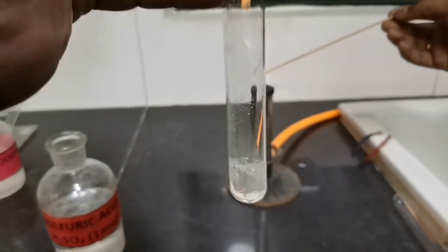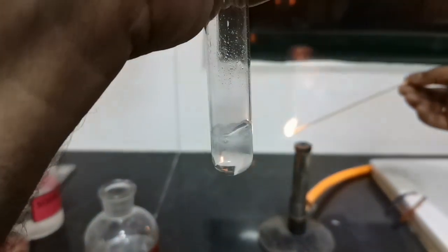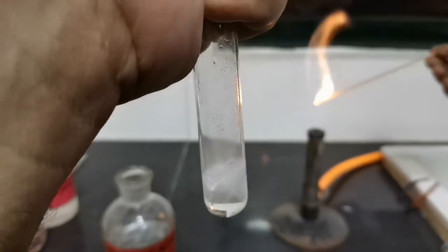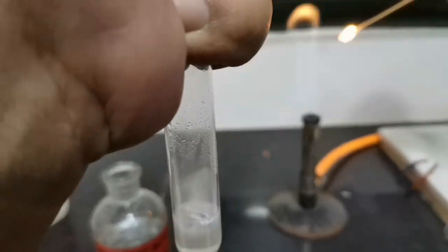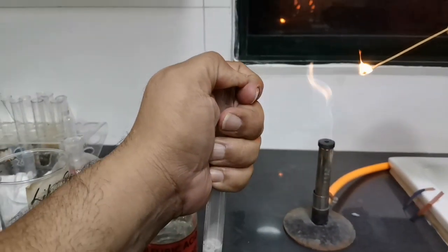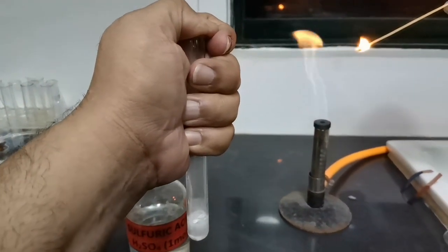When we add magnesium ribbon into the tube, as you can see it starts reacting and effervescence is being produced. I will cover the top of the tube with my thumb so that the gas gets collected in the tube, so that we can actually hear the pop sound when the gas is released. I can actually feel pressure being built in the tube and my thumb is being pushed out.